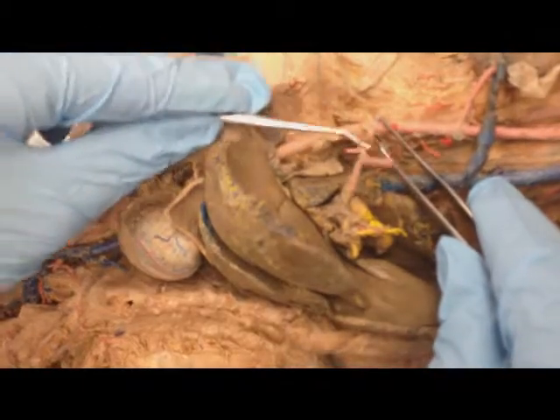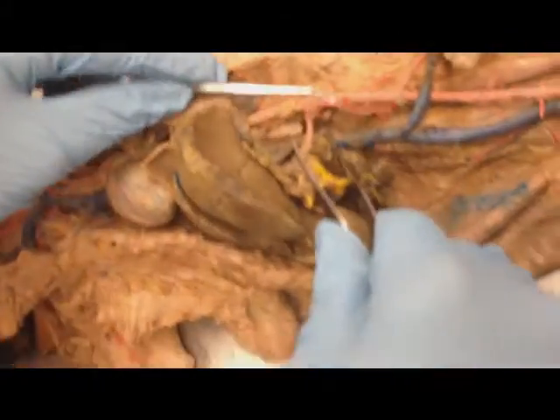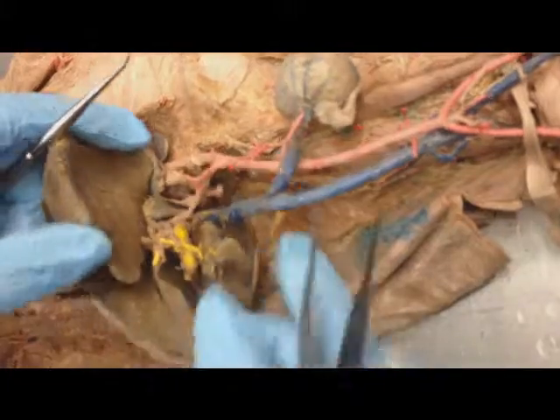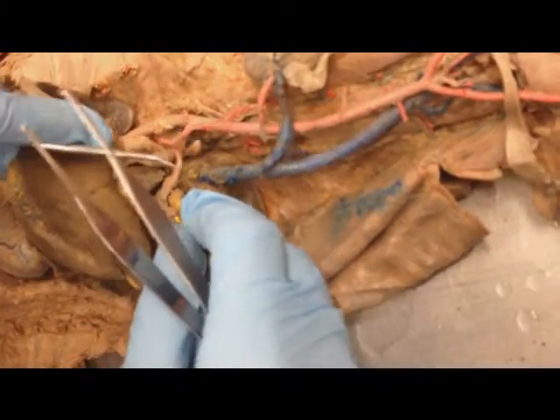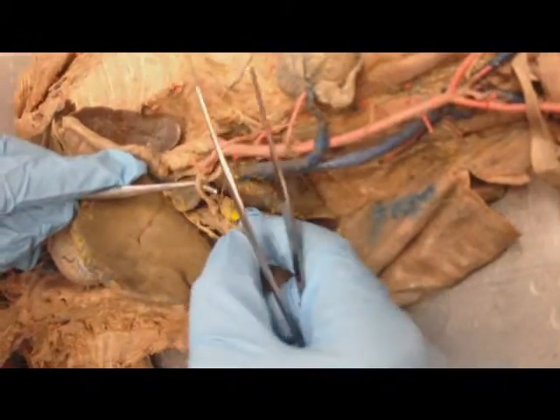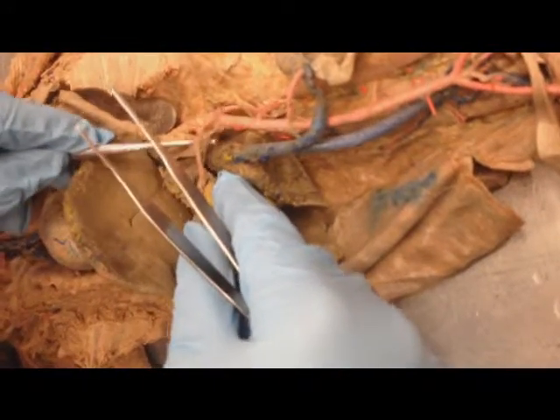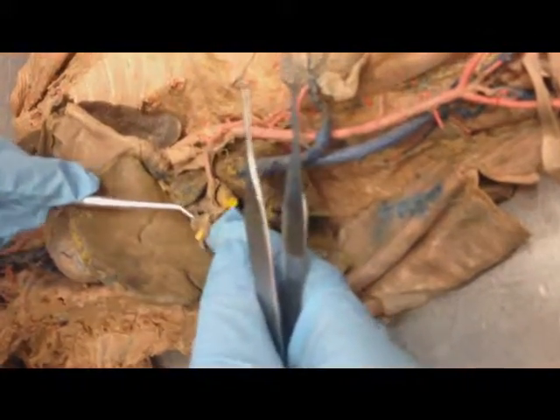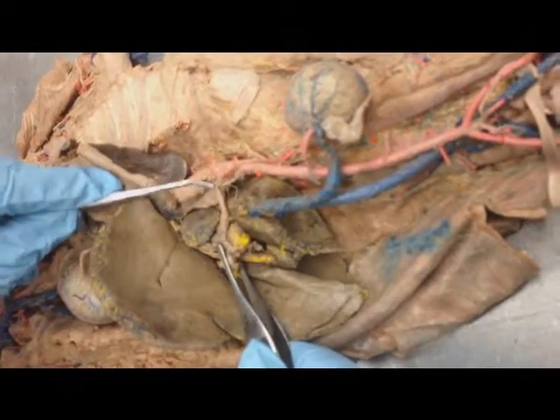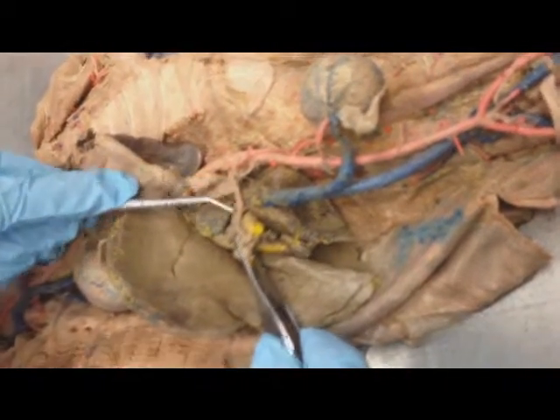Above that in this cat is the celiac trunk. Celiac trunk has 3 branches we need to know. So depending on your cat, you'll be able to tell exactly which one's which. For instance, this branch right here appears that it is going to what was once the pancreas. In that case, the pancreas is granule looking like this. This is the liver, but it kind of looks like this was once the pancreas. We call this splenic artery, which is weird because you think spleen, but it's not. It goes to the pancreas.